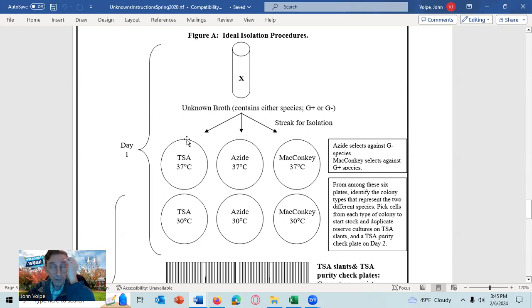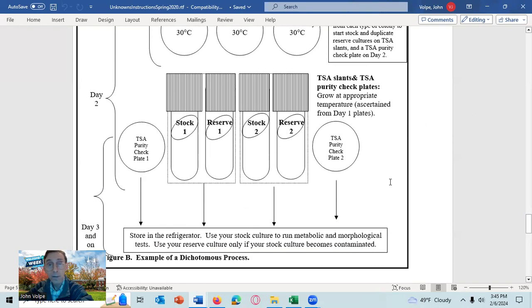And then you would streak it out a second time from an isolated colony on a second plate, picking your cells from a second isolated colony, and set up the stock culture from those cells that went through 2 colony isolation events. And then you'll make your stock culture from that. And then in the future, you would use this to set up all your test requests.